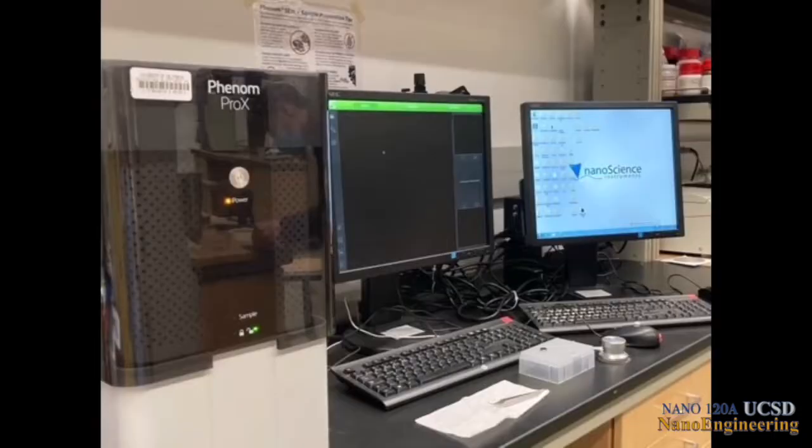Therefore, 5 kV can be used to image all samples, while the 10 kV and 15 kV are used for higher resolution imaging and X-ray generation.